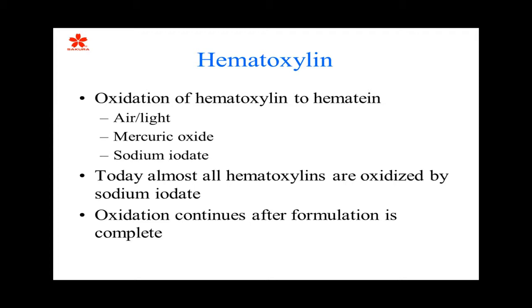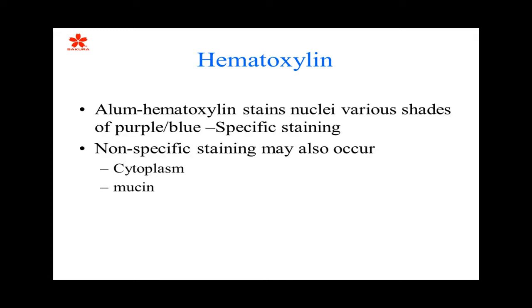This is another benefit of having a staining system, because the hematoxylins used in the staining systems are very stable. It eliminates the oxidation. When you have oxidation of your hematoxylin, this is why we have to filter from day to day. But the hematoxylins used in the staining system are very consistent, and there is no need to filter on a day-to-day basis. So that's another benefit of using the hematoxylins that are in the staining system.